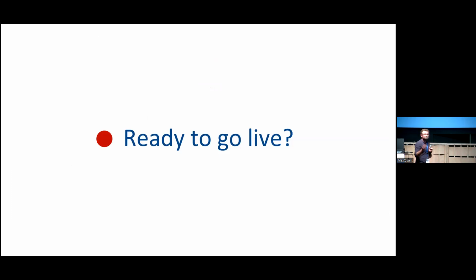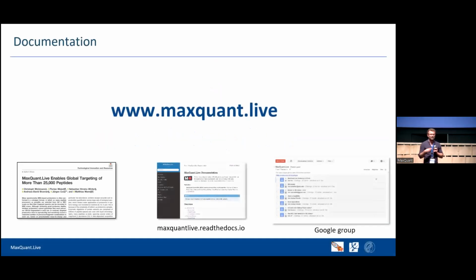And if you're interested and want to go live, first go to the website MaxQuant.Live. There is the paper, the original paper from four years ago. We have documentation which is kind of up to date, and there is a Google group where people are discussing and posting questions. So that's it.